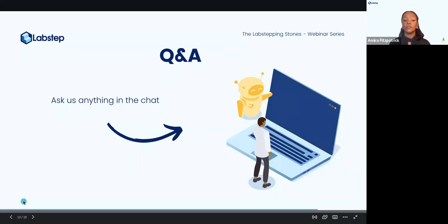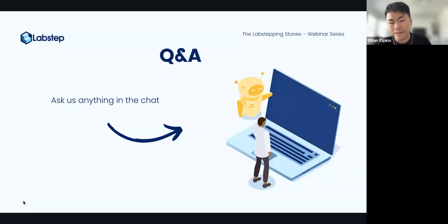Cool. Another one is, do I need to install any packages like pandas, matplotlib for the initial Jupyter Notebook, or is everything there? Yeah, for sure. So as I go back to Barney's guidance on this, a lot of the standard packages are already there for you to use. So that's pandas, matplotlib, numpy and scipy. You can install other ones. You can use the modulo pip command at the start of a script in order to install things.